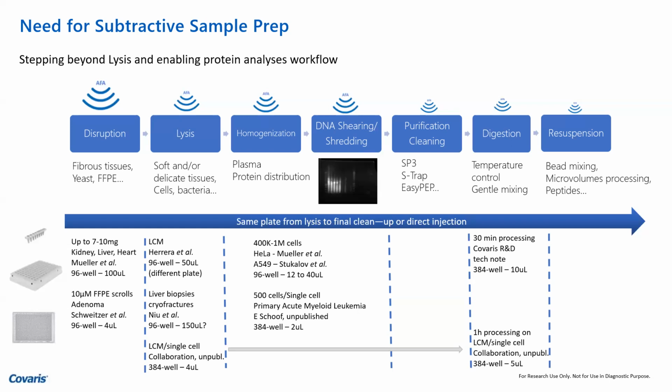So when you're trying to find a protein biomarker, I came up with the phrase 12 years ago, that you're looking for the needle in a needle stack. It's not the haystack anymore. You're looking for a specific protein in an ocean of proteins when you're trying to find a biomarker.